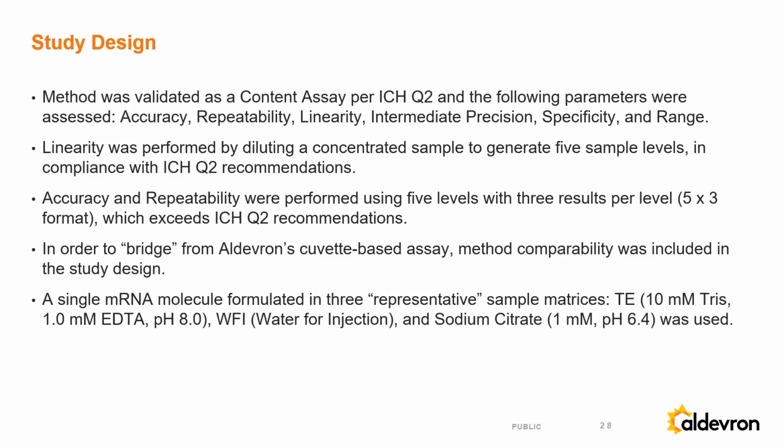The readout is the same. That's helpful for us as a company, because when we try to switch our clients away from an existing platform to a new platform, even if it's a very similar assay, it does require that extra bridging to give them the confidence that yes, the methods are comparable. We won't expect anything to be different from moving to the new method with a different manufacturer.